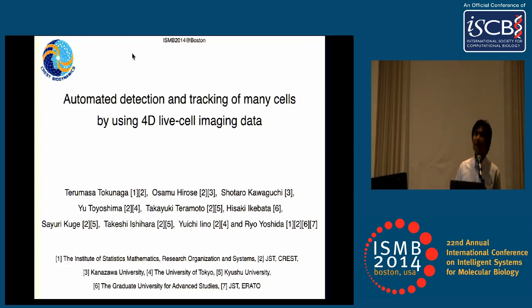Thank you so much. First of all, I would like to say this is my first time to come to ISMB, so I'm very glad to come here. I will show a series of image processing techniques for detecting and tracking many cells in 4-dimensional live cell imaging data.